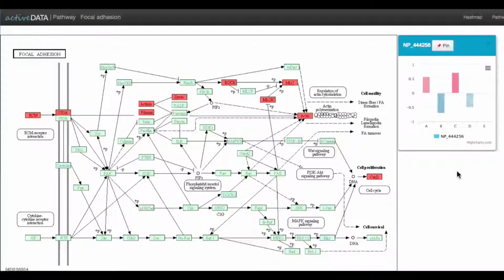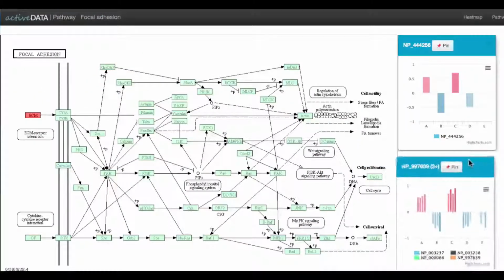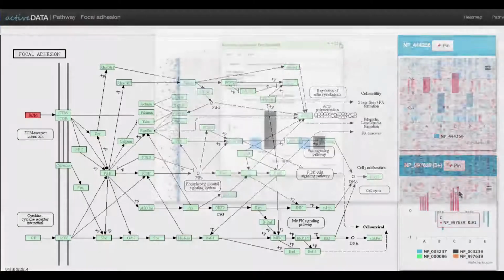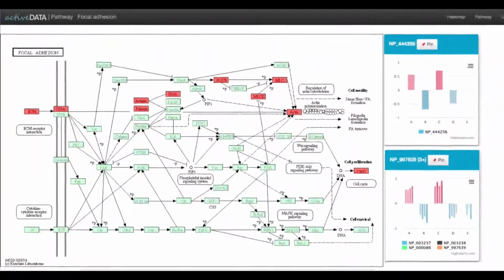Viewing multiple proteins at once portrays how the entire pathway behaves. The ECM box, or extracellular matrix, shows the expression of many distinct proteins which KEGG classifies to this function. These two tools, the heat map and pathway viewers, allow for fluid and intuitive navigation of biomedical data and are capable of displaying very large datasets in an intuitive and compact way.